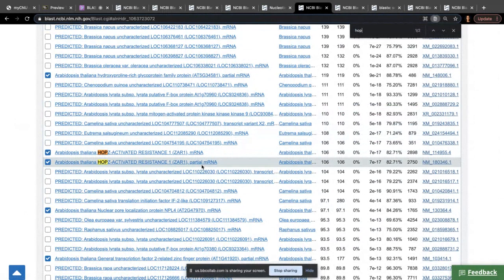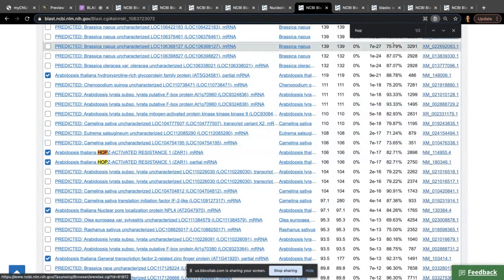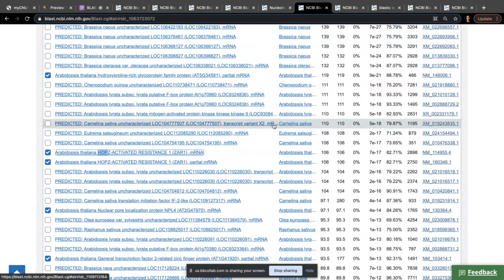Sometimes we sequence the mRNA from the ends. Well, we always sequence from the ends, but sometimes the ends don't meet in the middle, meaning we didn't sequence long enough for you to find overlap between the two sequences, as you did when building contigs. So those short sequences from the ends of the mRNA are called ESTs.